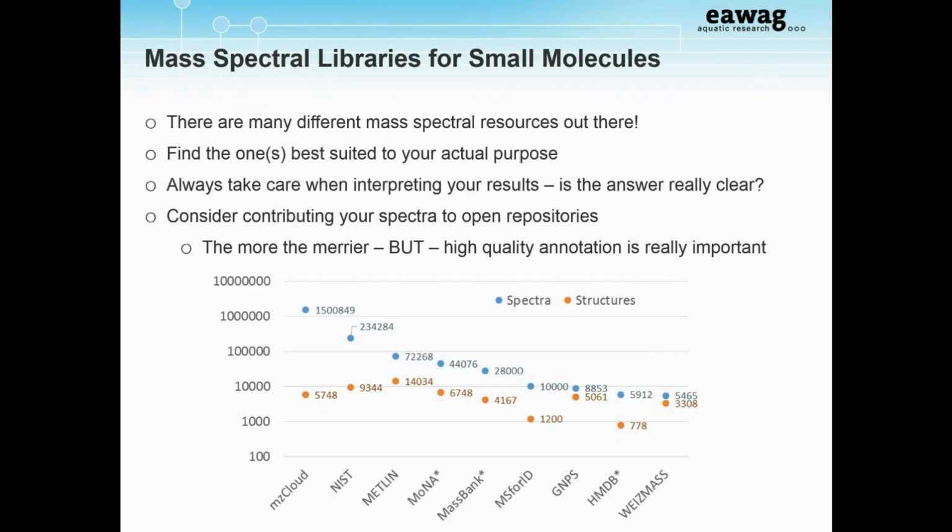Yeah, so for MassBank there is a tagged field which just gives you a little bit of an indication of whether it's a natural compound or a non-natural compound. For all of ours we've saved NA because we can't tell if it's natural or unnatural, but we've saved that it's an environmental standard, for instance. There are other libraries like RIKEN MSn that was specifically developed on plant metabolites, so it only covers this group. So again, this depends a lot on the resource.